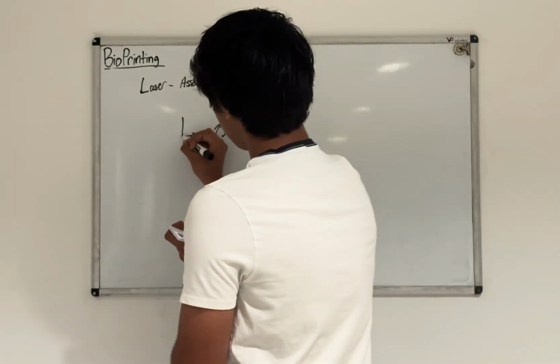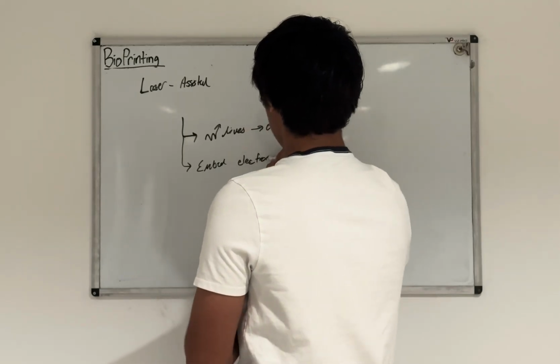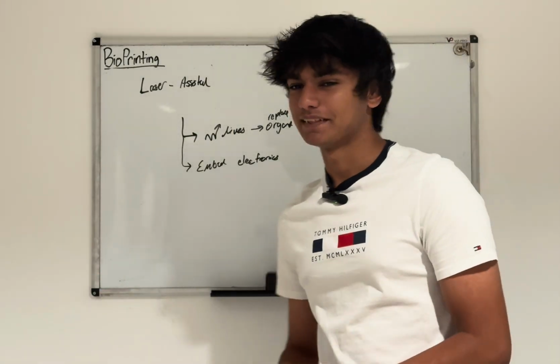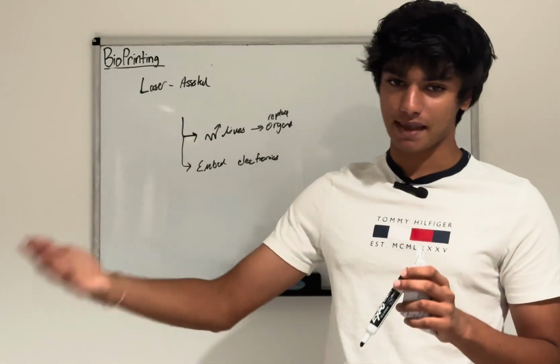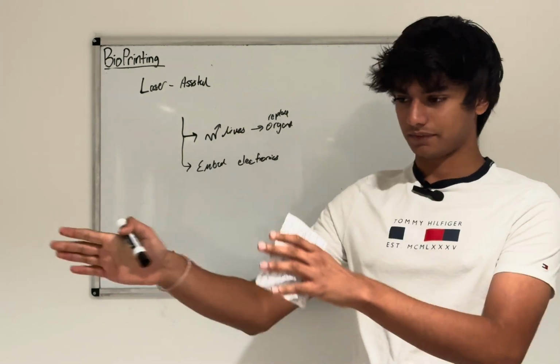And also, we can even embed electronics into tissue or embed other stuff that makes it better. But that's really sci-fi kind of right now. Right now, we're still focusing on getting the main technology working. And yeah, that's how bioprinting works, and that's kind of where the future is.